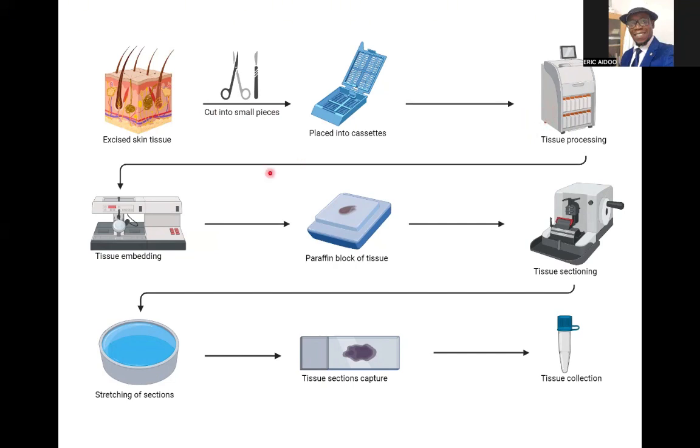And to do all that and then bring the tissue out, then you do the embedding with the paraffin, and then you block the tissue, then you put it in the microtome and you section. Okay, once you section it, it will come out as a ribbon, very flat, thin slices, and then you put them on top of the water and skillfully pick it onto the slide, and you mount it, and then you stain and cover it with a cover slip.